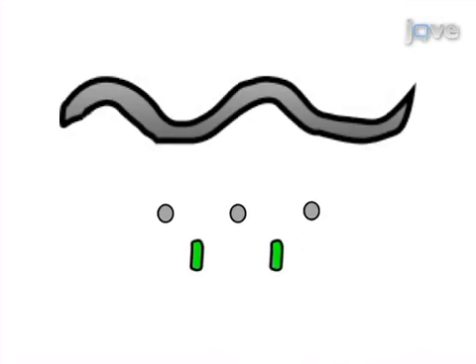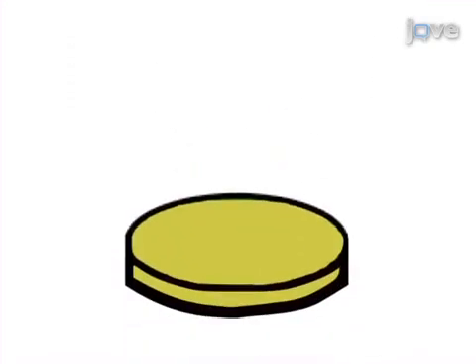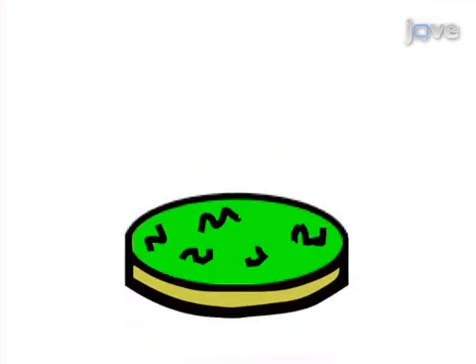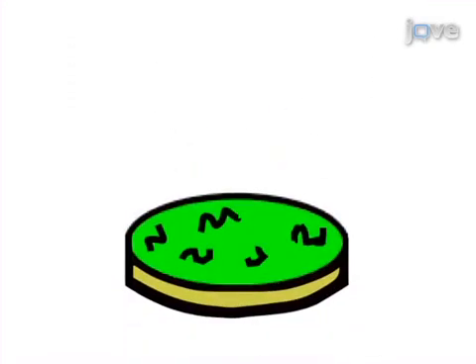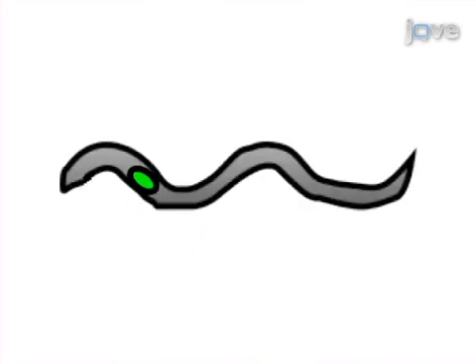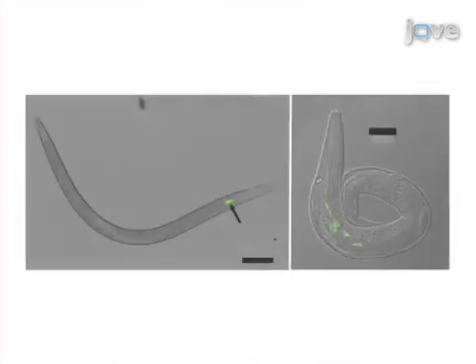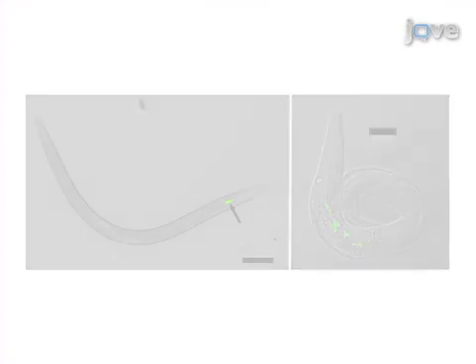Next, the axenic nematodes are grown in combination with their fluorescently labeled bacterial symbiont to allow natural association. Ultimately, the localization of the bacterial symbiont within the nematode host and the frequency of this association within the nematode population can be determined by fluorescence microscopy.